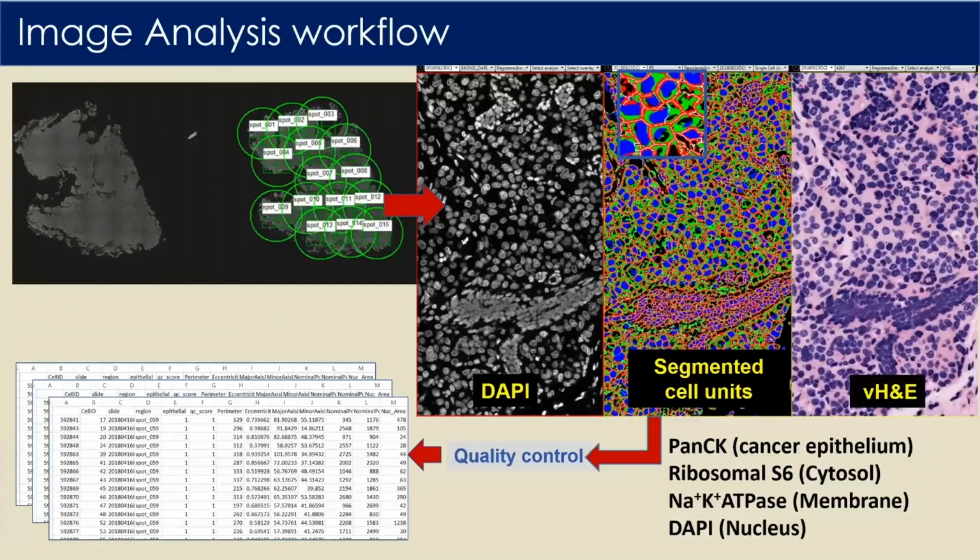In terms of the image analysis workflow, it's actually quite similar to other protein multiplexers. DAPI is imaged in every round so that we can register all the images at the end. And also there is a workflow for automated cell segmentation. So after all the analysis, we will get an output of the features of each cell together with the expression of each protein on single cells.